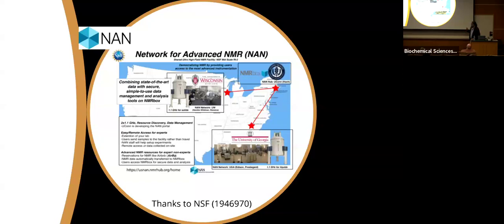But Chad and Katie have a 1.1 here that I'm sure that you've all seen, and it's dedicated largely to solid state NMR, biosolids and materials. We have sort of the sister 1.1 in Georgia. It's a very low resolution picture, sorry about that. And ours is dedicated to solution NMR, metabolomics, and structural biology.